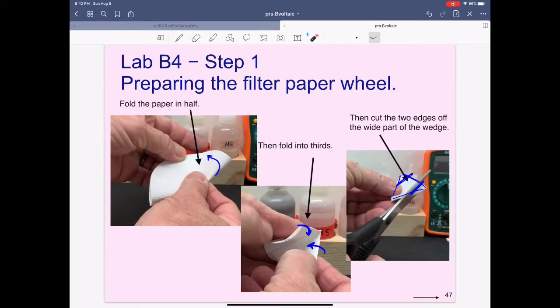Step one in this lab: we need to prepare the filter paper wheel. We'll fold the paper in half, then fold it into thirds, then cut the two edges off of this pizza wedge.